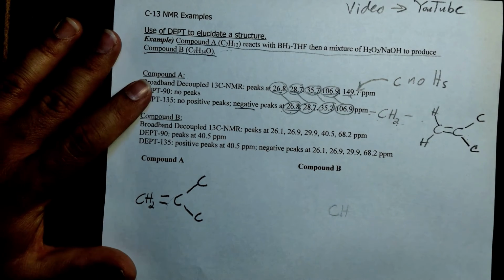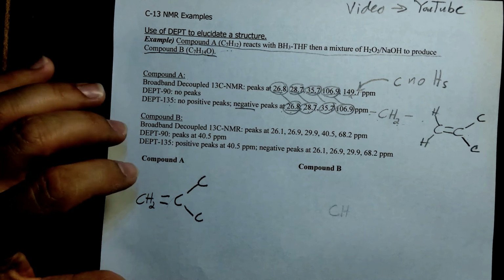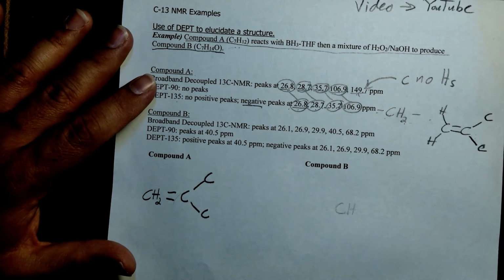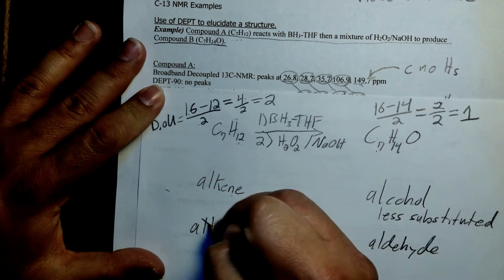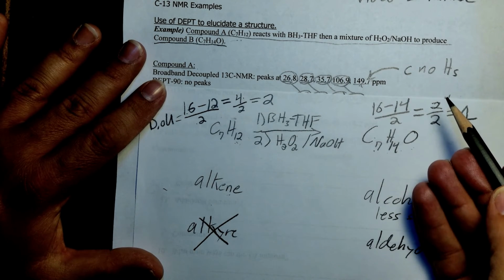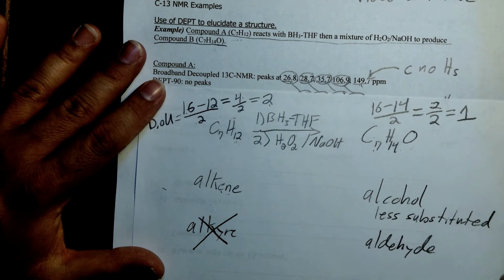And I don't know if you've realized this, but one way that you can get a lot of symmetry like that, where you've got multiple shared peaks, one way to get a good mirror plane of symmetry in a molecule is by ring structures. So if you think about that, and then also we ruled out the alkynes, so that 2 degrees of unsaturation that we talked about right here for C7H12, it can't be alkyne because we already showed, based on the chemical shift of our C13 spectra, there cannot be an alkyne carbon. It has to be an alkene. So that other degree of unsaturation has to be due to a ring.